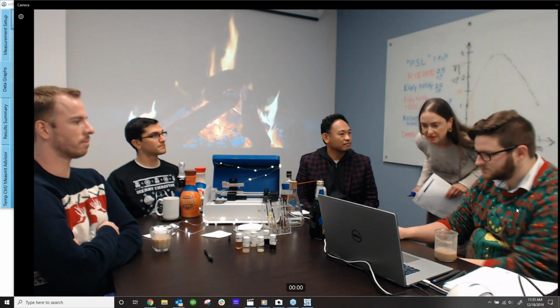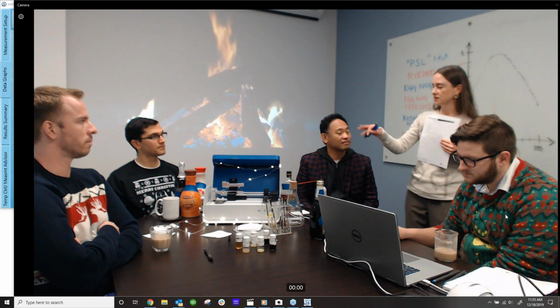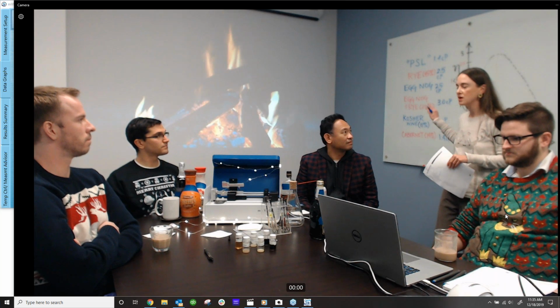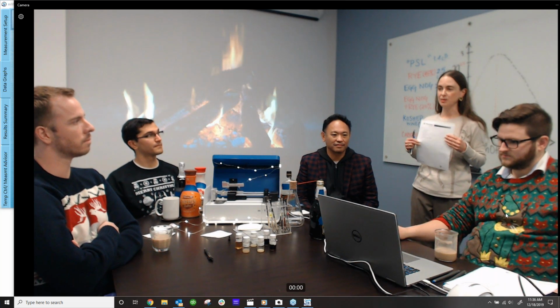While Brandon is looking at the other questions, I'll point out, in addition to varying channel depth, we have various scales for the pressure sensors. So all of our beverages, as you saw below, are on the low end of viscosity in the grand scheme of things. So we were using our most sensitive chip with the lowest pressure range.